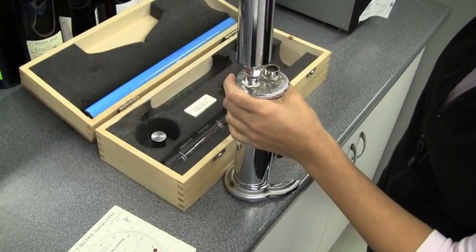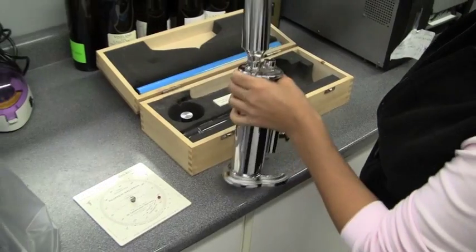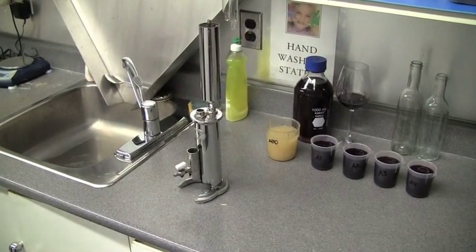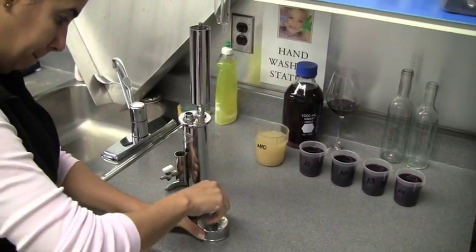So, what is this lovely, shiny contraption? It is not the hood ornament from a '57 Buick. It is actually an ebulometer. Try to say that five times fast.